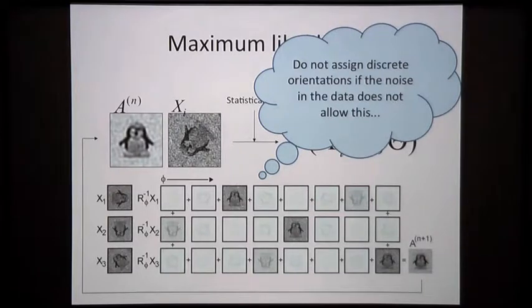In fancy terms, it's called marginalization, but it boils down to having probability-weighted assignments of your missing parameters, which in this case are the orientations. Something very similar happens in X-ray crystallography, where you do phasing and you don't know the phase, and you have these Mickey Mouse plots where you calculate figures of merit over phases, like probability-weighted averages. So this we iterate again. If you want to think of it in more intuitive terms, why would this be a good idea?